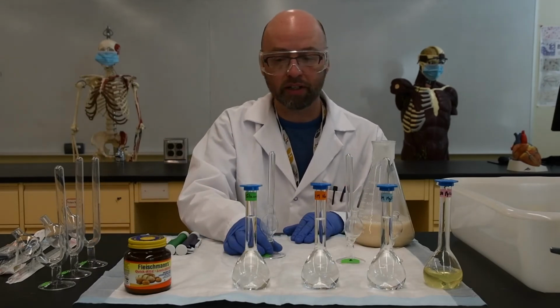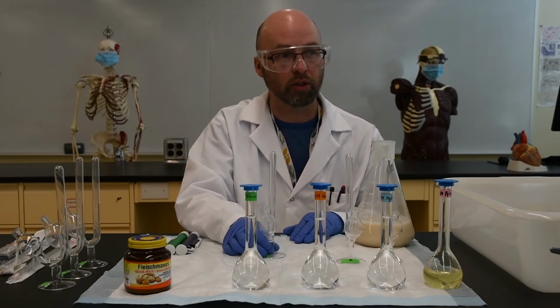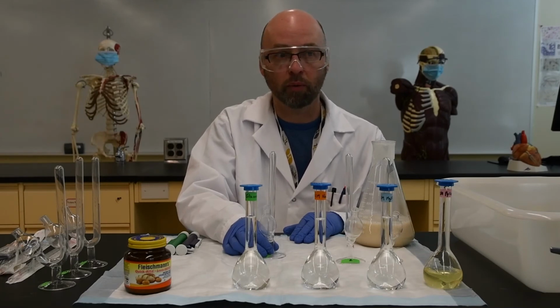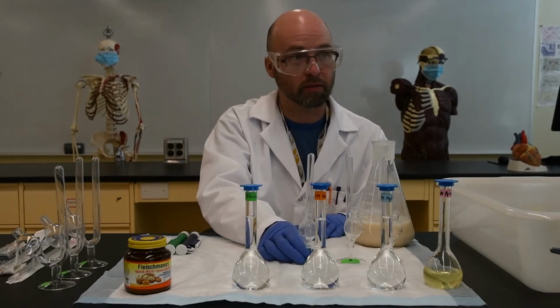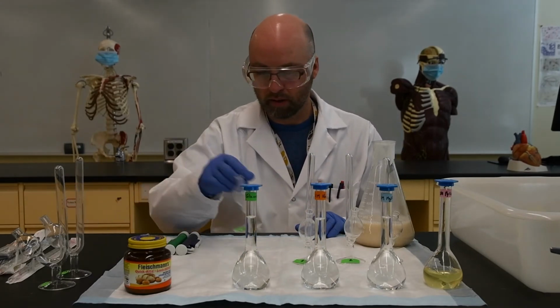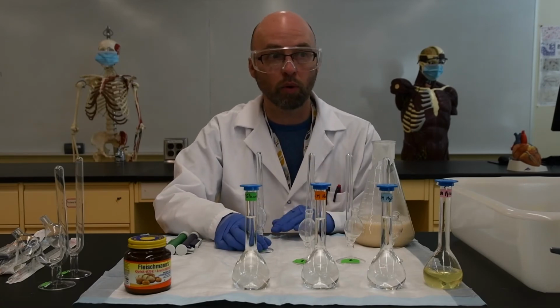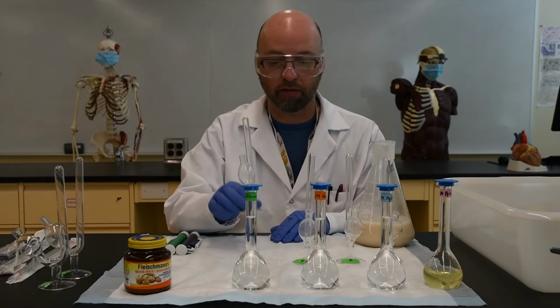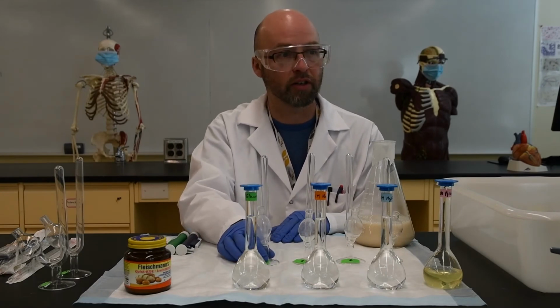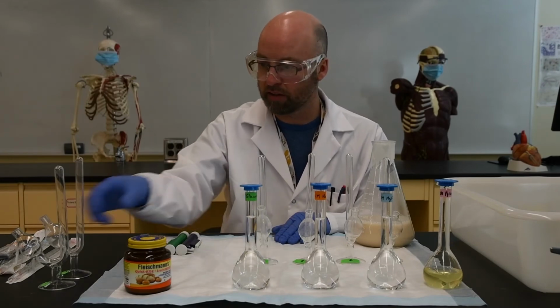Tube number 3 is going to have an inhibitor. It's going to have 0.5 ml of the sodium fluoride, 2.5 ml of glucose, and 4.5 ml of water, as well as 10 ml of the yeast. Tube number 4 is going to be 10 times more of the inhibitor, so we'll see whether there's an effect there. We're going to have 5 ml of the sodium fluoride this time, with 2.5 ml of glucose and 10 ml of yeast.